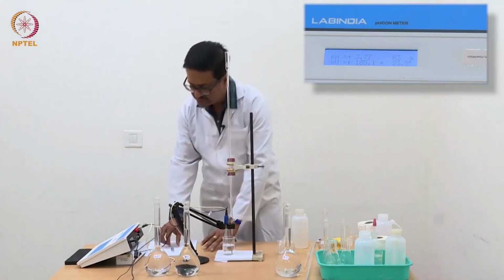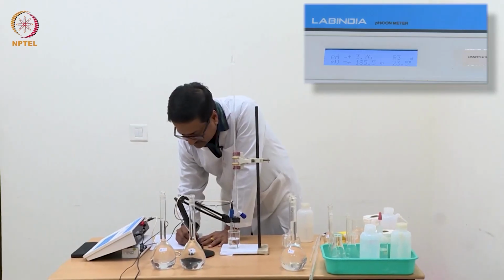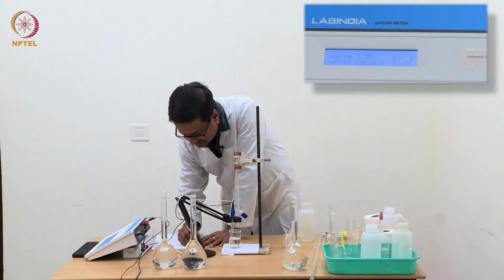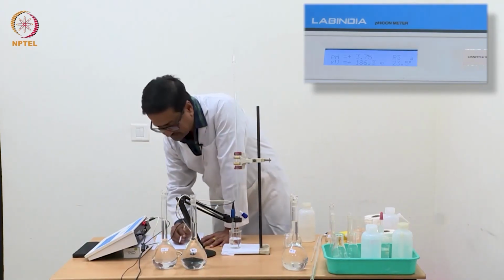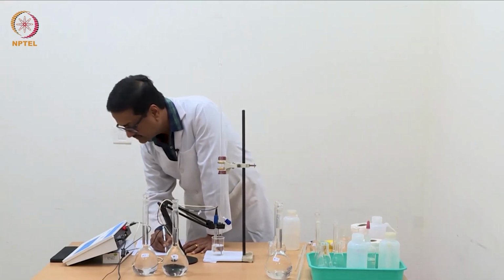Let us note down this value before addition of any NaOH, that is, added volume of NaOH is 0 and the pH is 3.74.